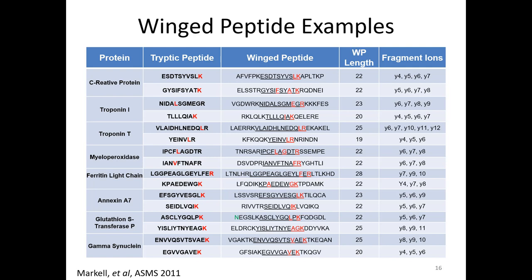The idea here is we know trypsin comes in and cleaves after arginine and lysine. But we don't know if there is a local effect based on the amino acid sequence. We know if there are additional lysines or arginines near the N terminus or the C terminus that we can see something like ragged ends, where it might cleave at this lysine, and if it does that first, it might not cleave at this one. Or if there's a KK or an RR, two in a row, we don't always see 100% of the peptide present in one form. It's often split. So this can cause issues.